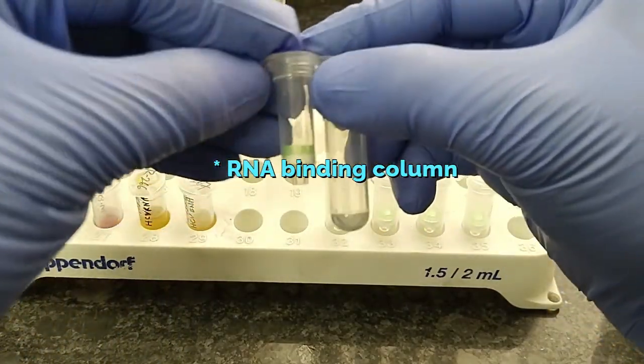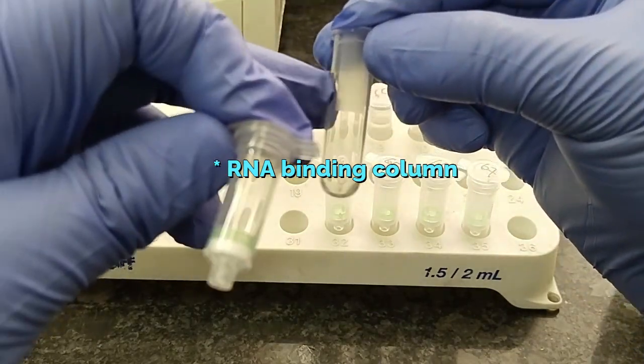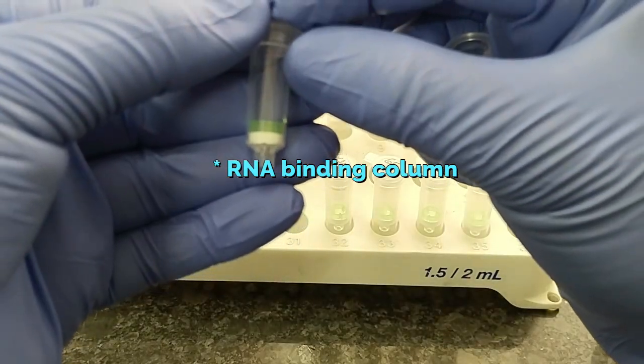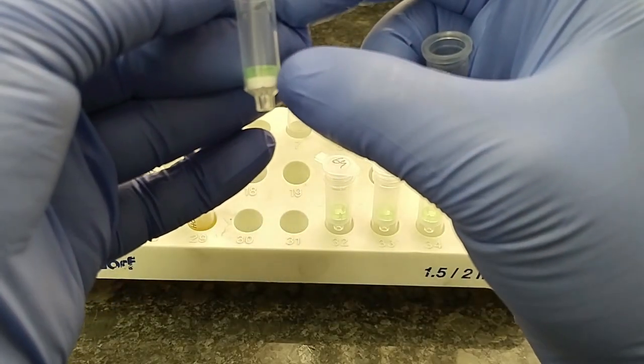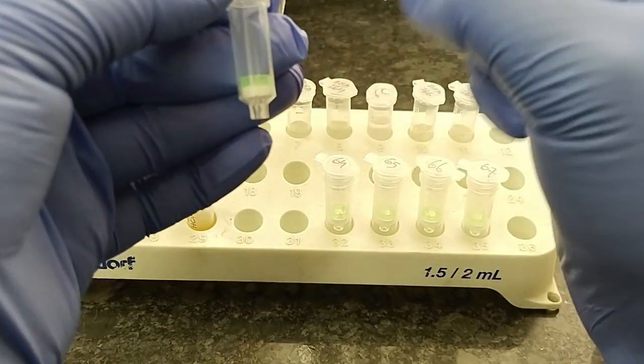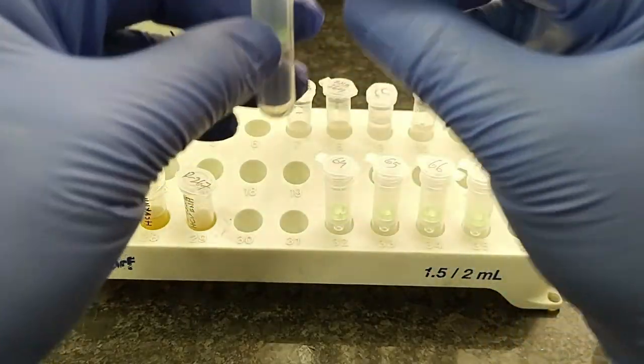There are two parts. This is called the collection tube and this is called the column. Here you can see there is a type of silica column where RNA gets trapped. This is the RNA binding column.